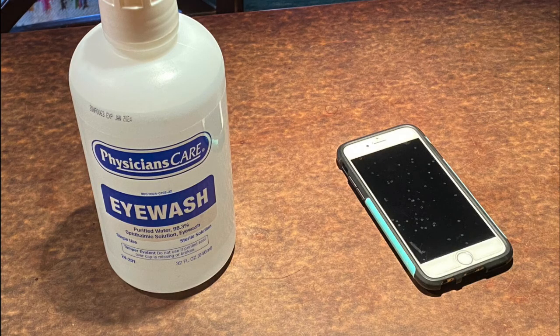When in doubt, flush it out. I'm also working somewhere with a telephone connection in case I or someone else needs to reach emergency services. Since these contingencies are required in an emergency, they must by definition be planned for in advance, not improvised after an accident has already happened.